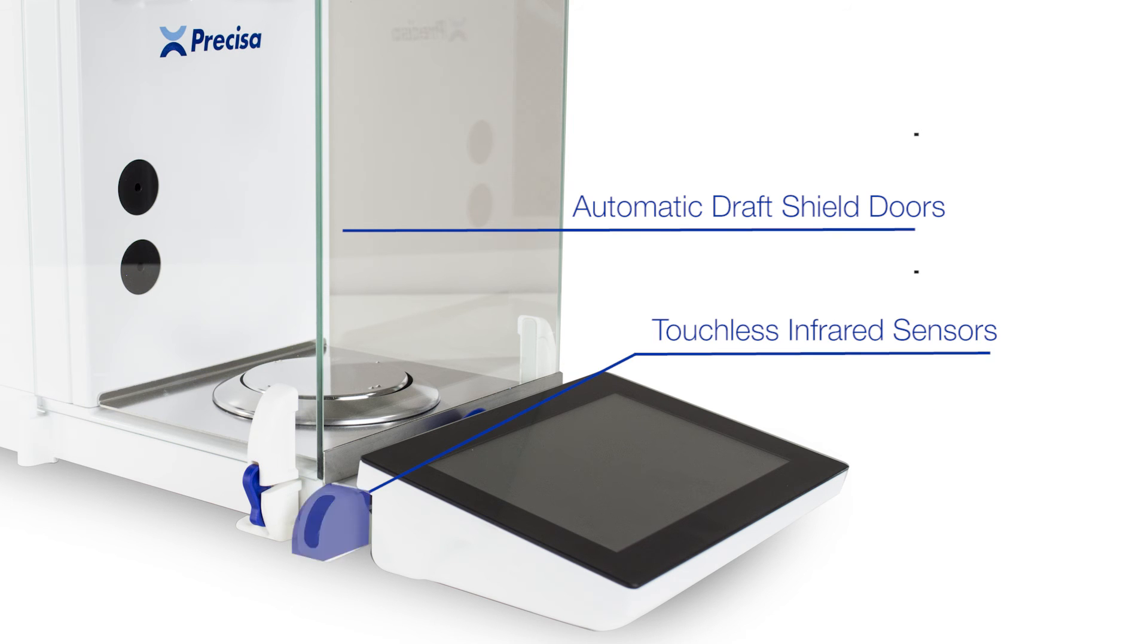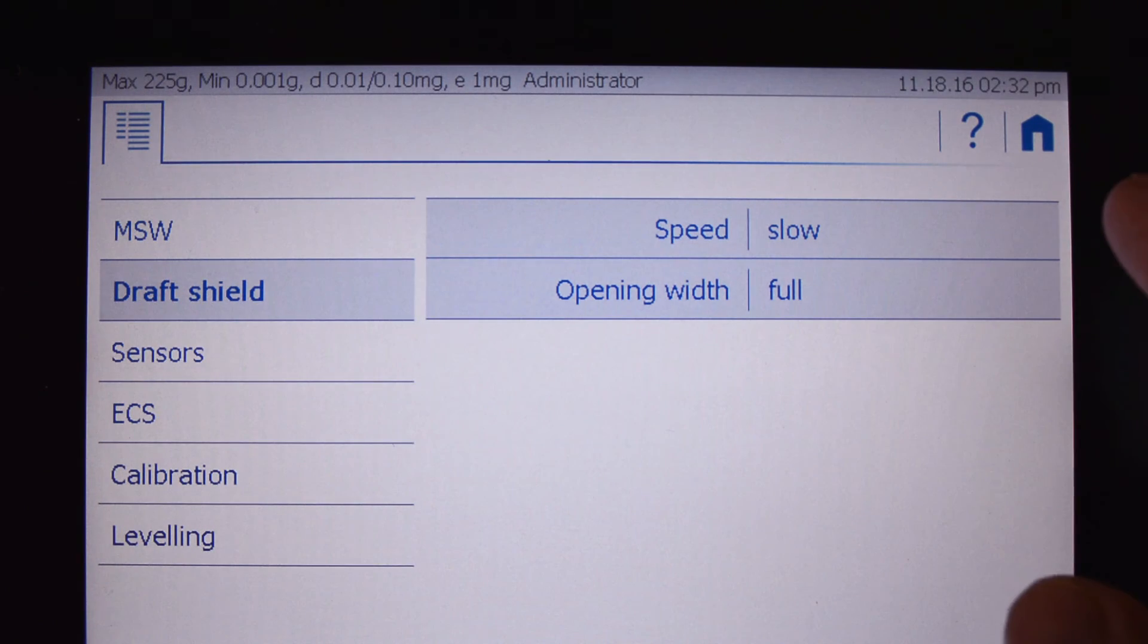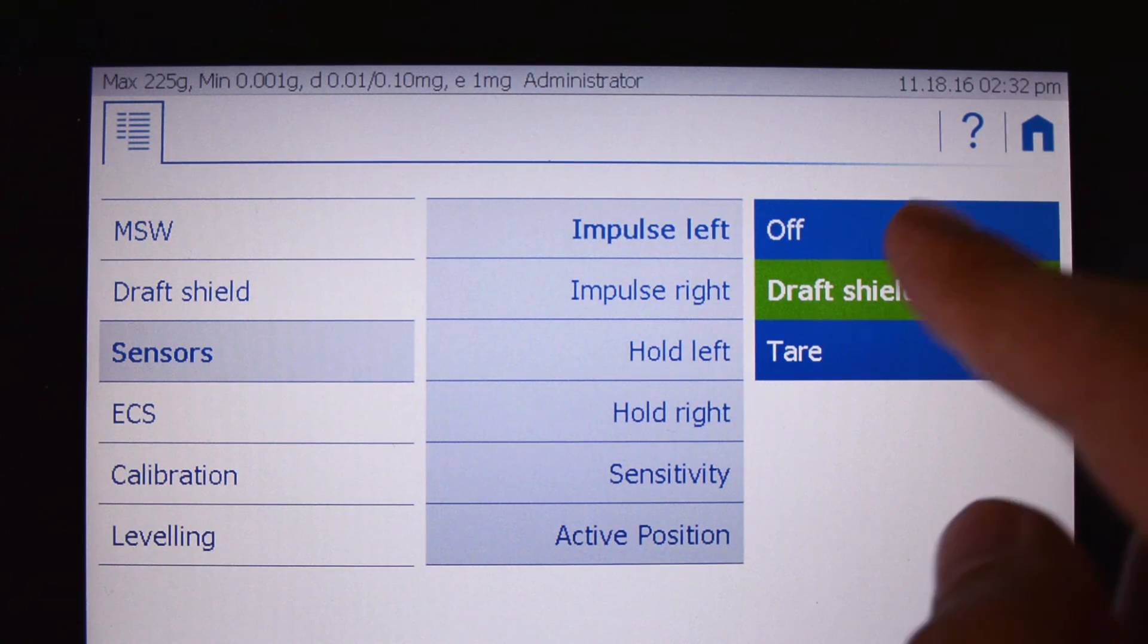It is equipped with automatic draft shield doors that are controlled by touchless infrared sensors on the sides. The sensitivity of the sensors can be changed to the settings on the tablet, and the function of each individual sensor can also be changed to tare or zero with a wave or a hold of the hand.